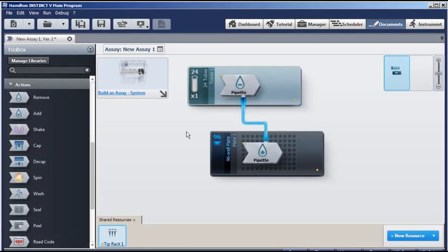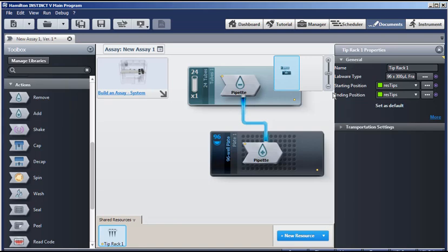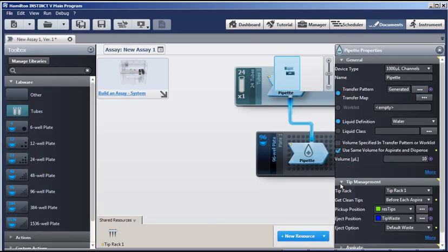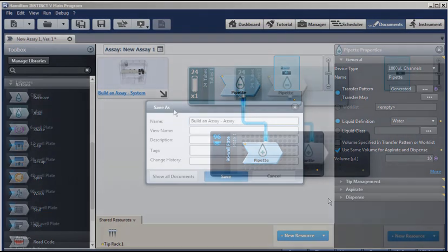And finally, the tips that we use are shared resources. Just like a trough of liquid, it can be used by any assay. So the settings are here for the tip rack. It has a starting and ending position. We know that's res tips. And you can choose the type of tips right here. There are other settings, including tip management. So we verify that our pickup position is res tips. And the eject position is the tip waste. And all the other pipetting properties, such as selecting a liquid class, or details about aspiration and dispense, can be examined later.